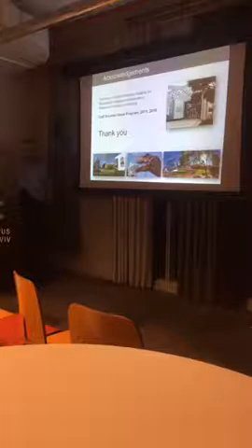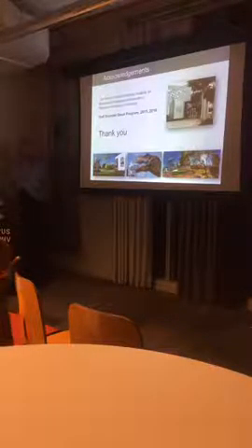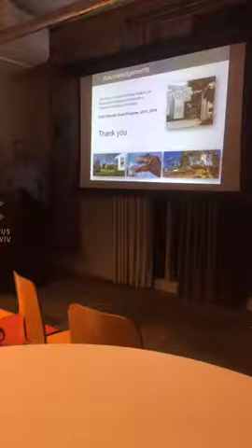You said something about the rate you take the pictures, that you have 30 frames per second. Can you use 2 cameras simultaneously with a little bit of phase between them to get 60 frames? Yes, we did it. So there's no real limit.